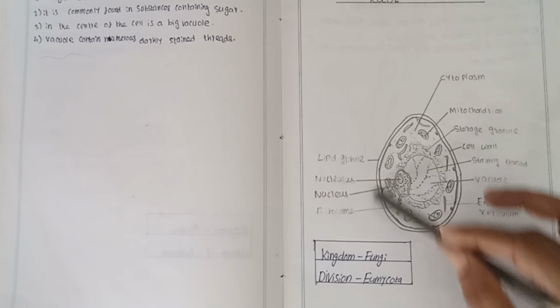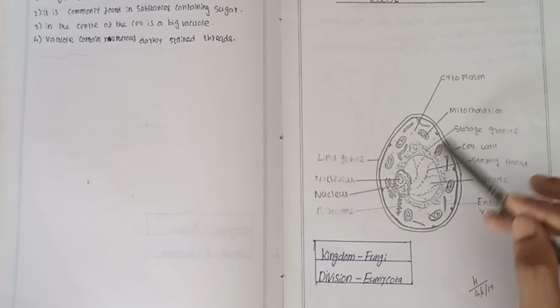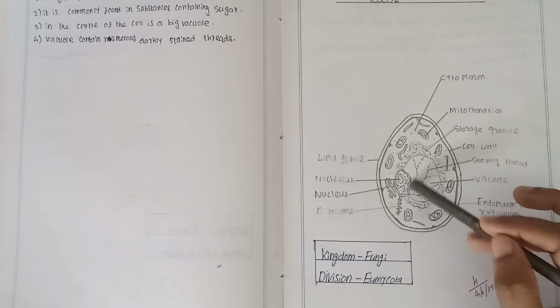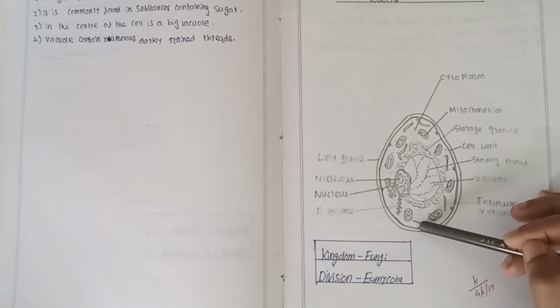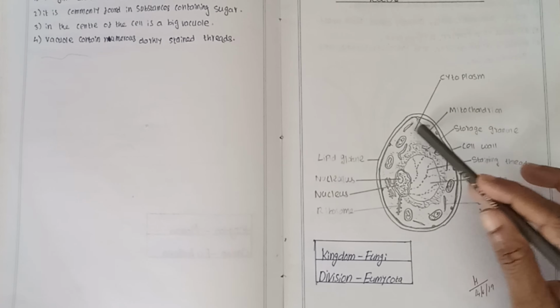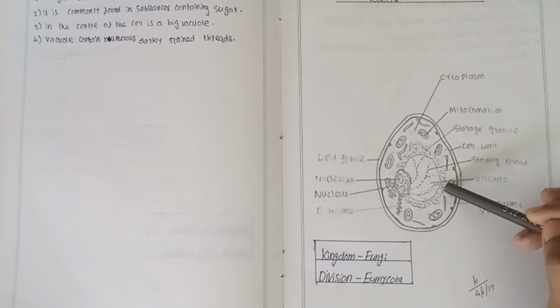The cell is ovoid in shape. A distinct cell wall and nucleus are seen. One or more vacuoles are seen in the cytoplasm. The cytoplasm is granular, with glycogen and fat or oil globules as reserve food material.